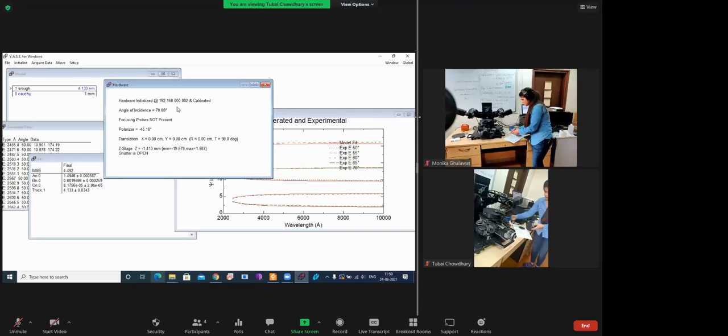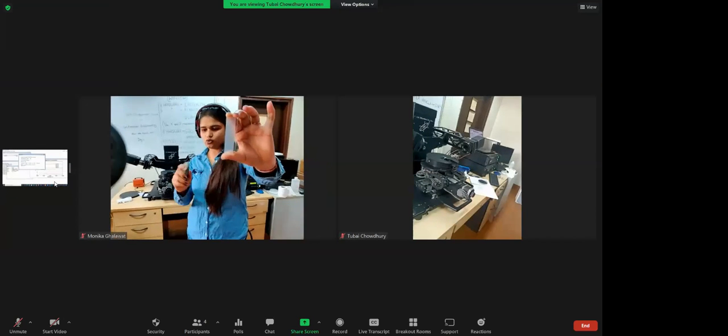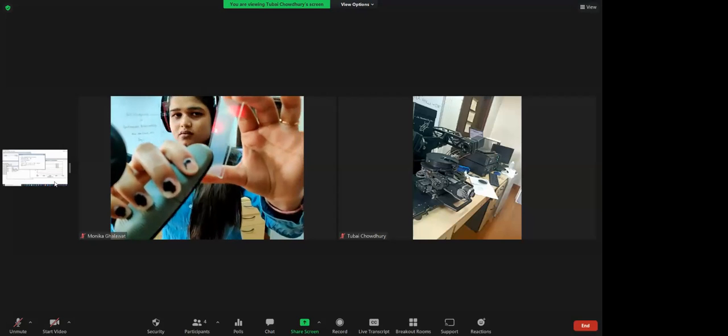This is a glass which I'm saying is not very optically smooth. So this is a normal pointer. You can just do this and you will see the spot. The spot is visible. Is it visible in the camera? Yes, it is visible.